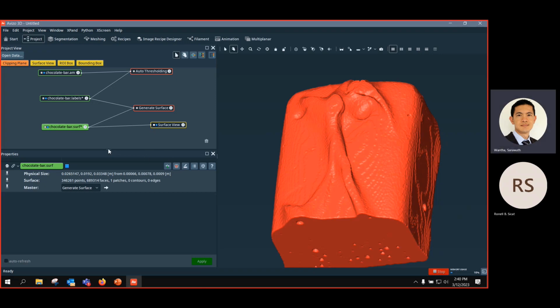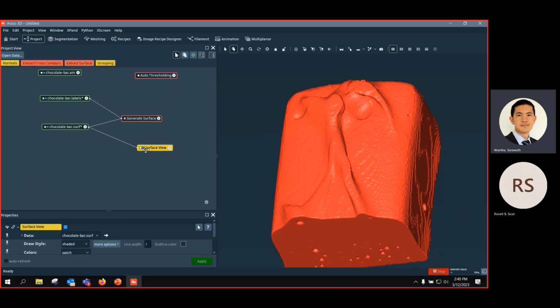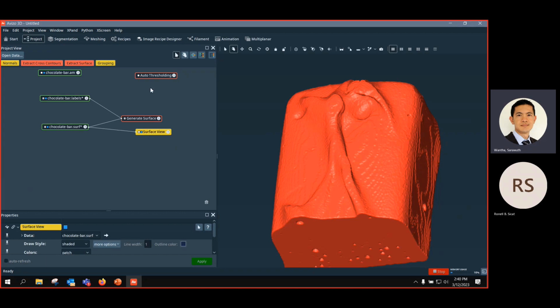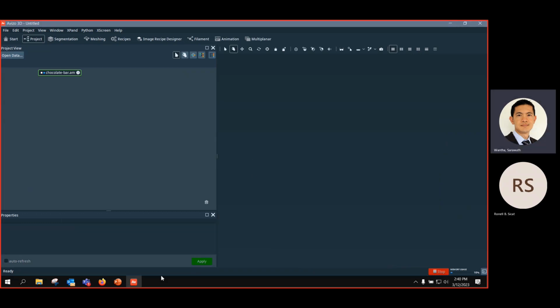What we see so far is still automatic segmentation, and we mostly use project view because, when you get to this principle, it's really flexible. You can add, remove, and modify your workflow. You can come back and reapply it anytime, so it's really convenient. But we also have another, easier workflow called the guided linear workflow, which could be good for a beginner to start with and get some ideas.